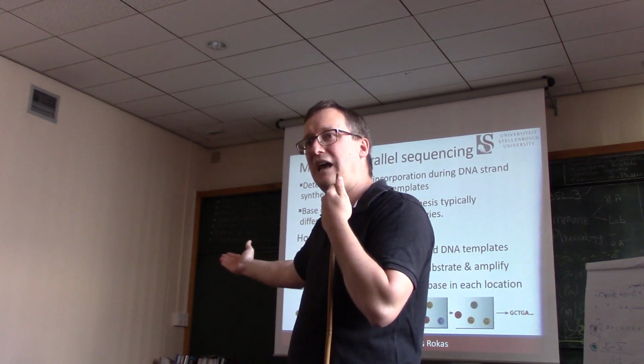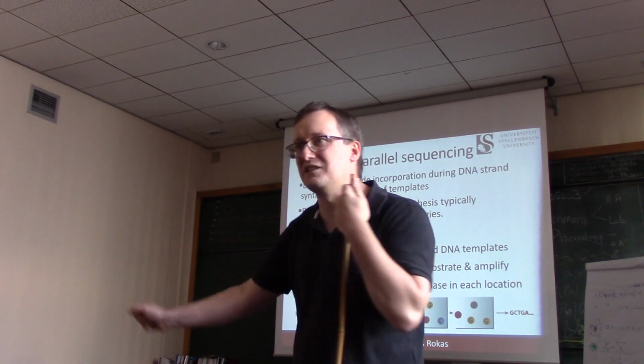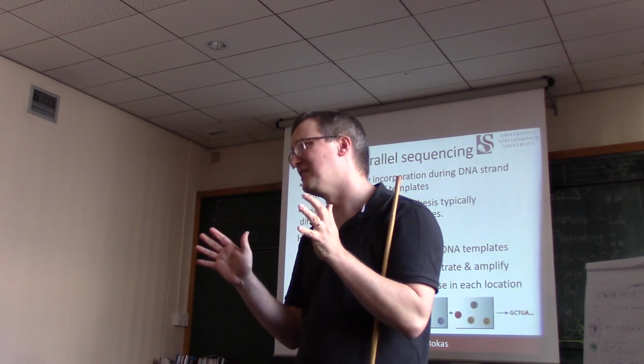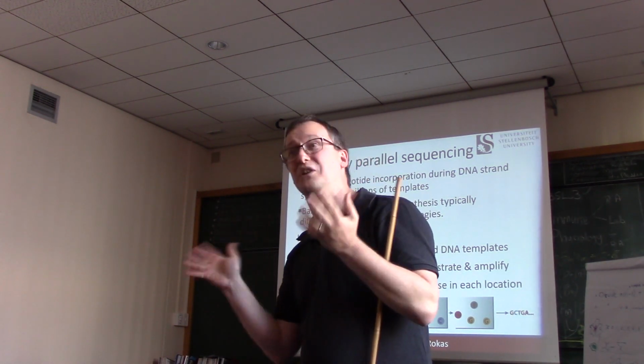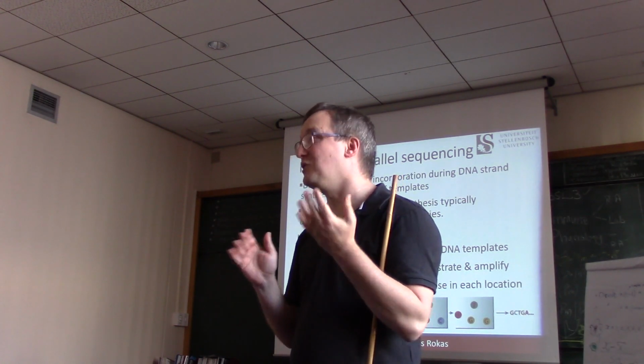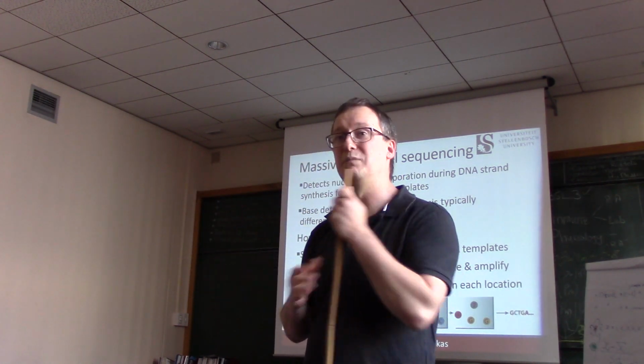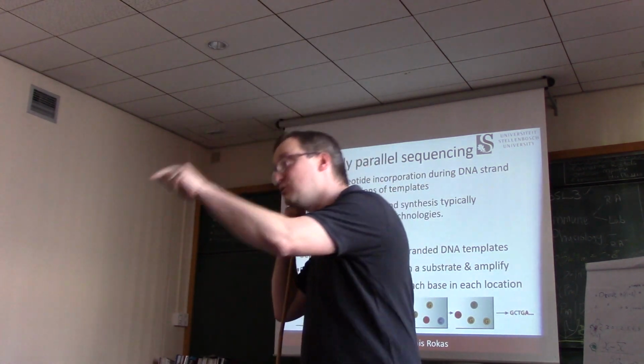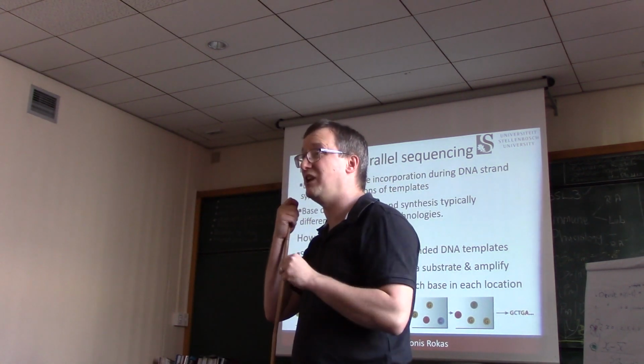The sequencers have the ability to read fluorescence at a much greater resolution than 10 megapixels because they're routinely sequencing 10 million things at the same time. So you can imagine the resolution required to unambiguously match a letter from this moment in time to a letter from that moment in time at the same location.